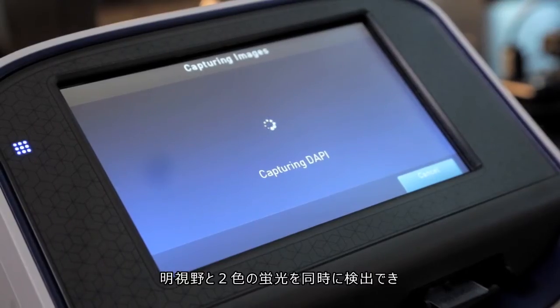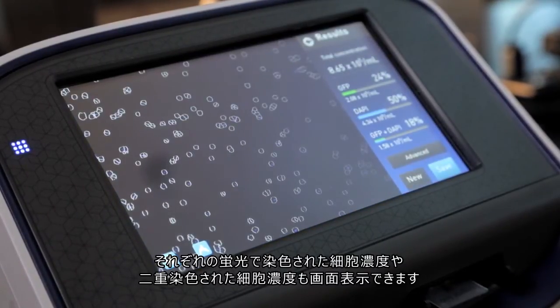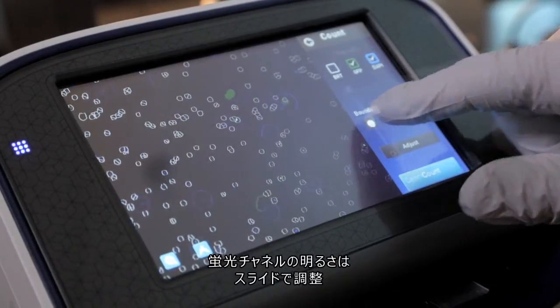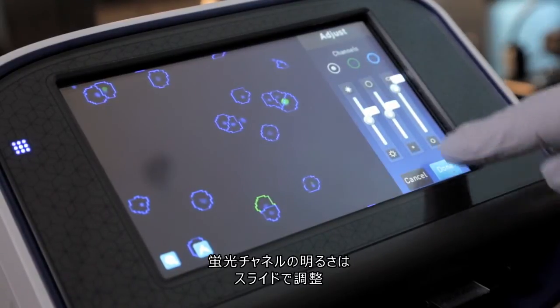The Countess2 FL cell counter allows the simultaneous counting of cells using bright field and up to two fluorescent channels. Total concentration of cells in each fluorescent channel and dual fluorescence are shown in the results screen. Brightness of the fluorescent channels can be adjusted using sliders to increase or decrease the threshold for what is counted.